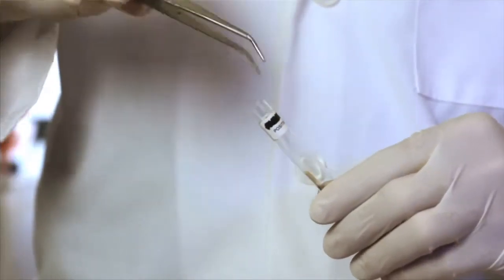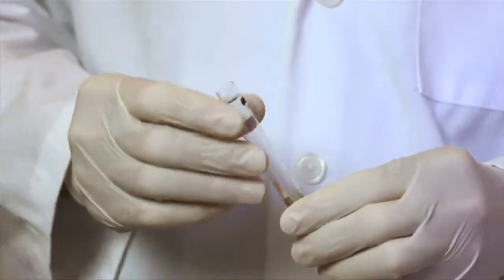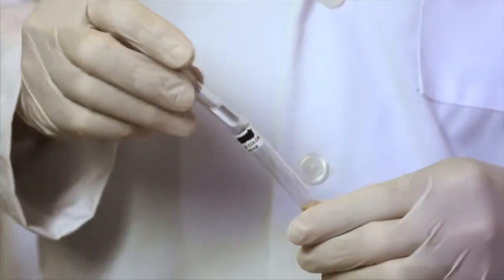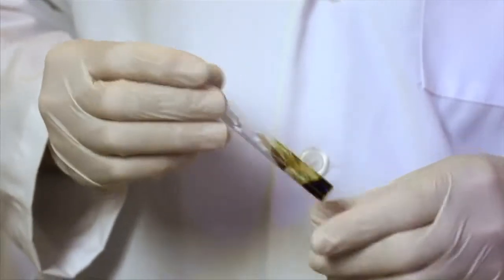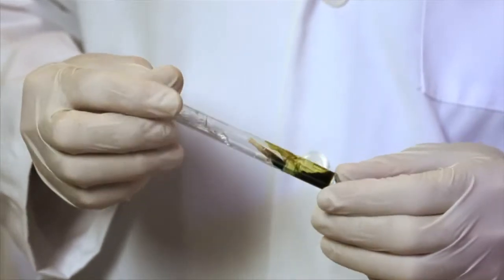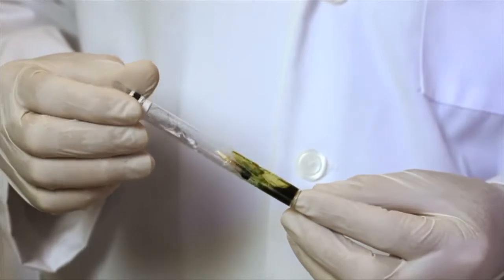You follow directions, but it's very important that you follow them specifically. Again, science is all about facts and specifics and details. So if I use a couple drops of the alcohol plus the phenolphthalein that we use, the chemical component, and then hydrogen peroxide, the combination of those things in a specific order will then yield whether or not something tests positive for blood or not.